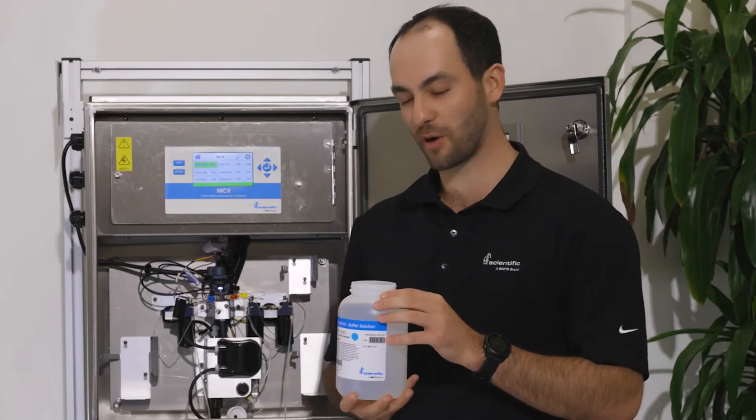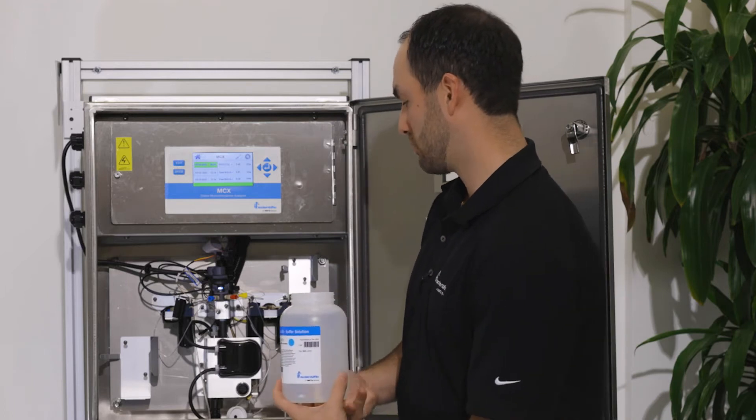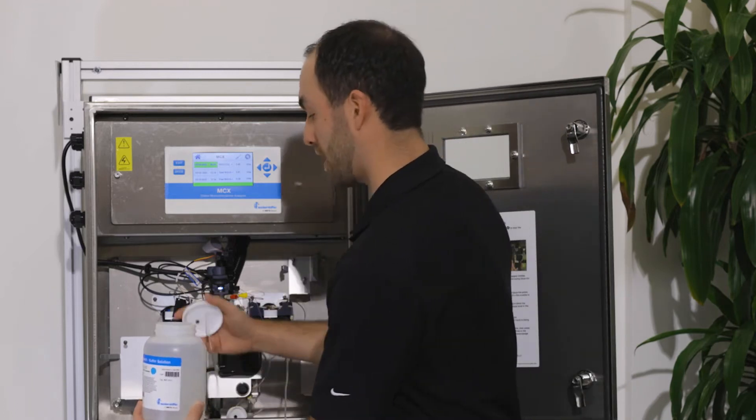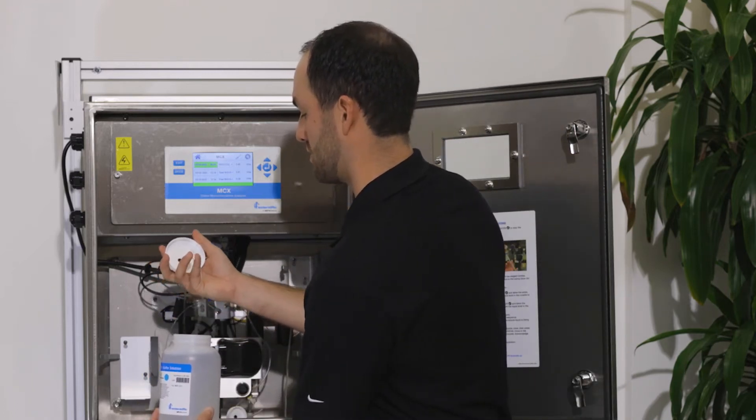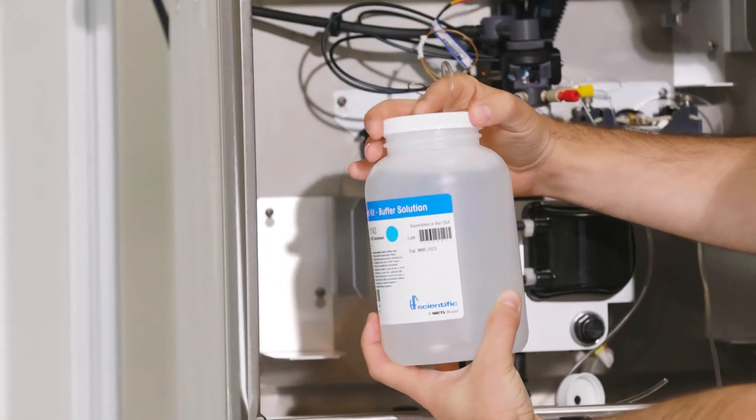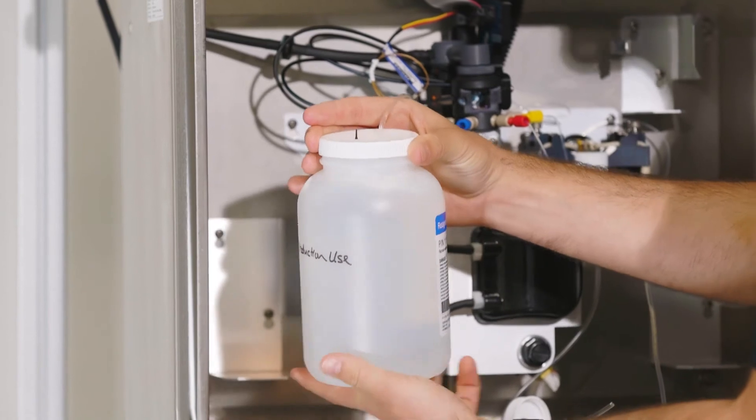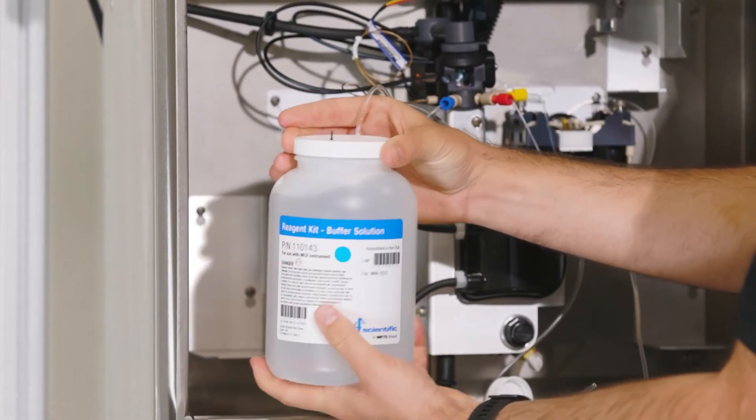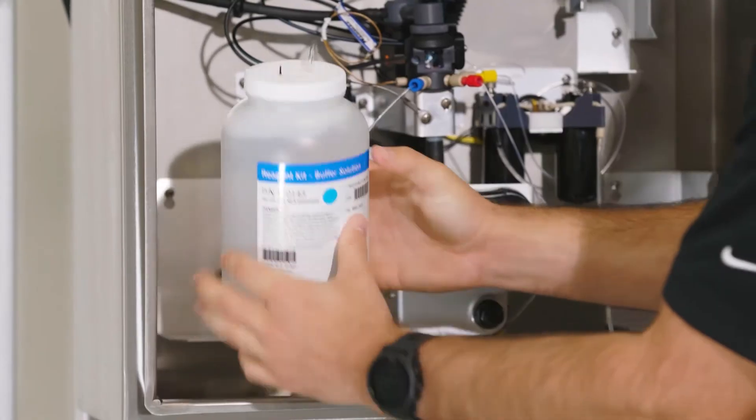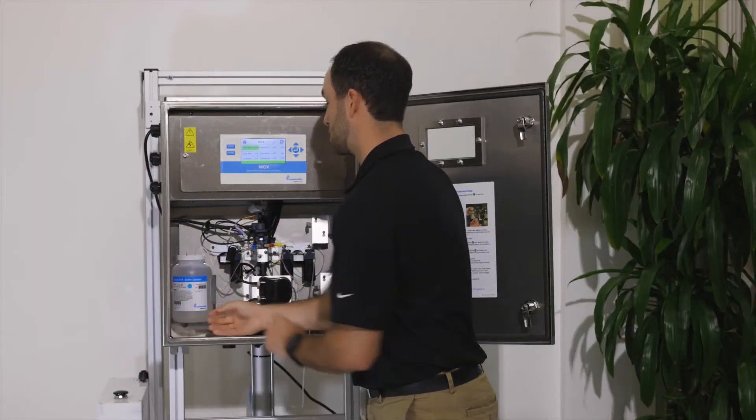We will begin by replacing our buffer solution. What we like to do is hold the bottle and put the line in, and then hold the cap in one place and twist the bottle into the cap. This will ensure that we're not twisting any of our lines inside the bottle. Place the reagent bottle into its spot.